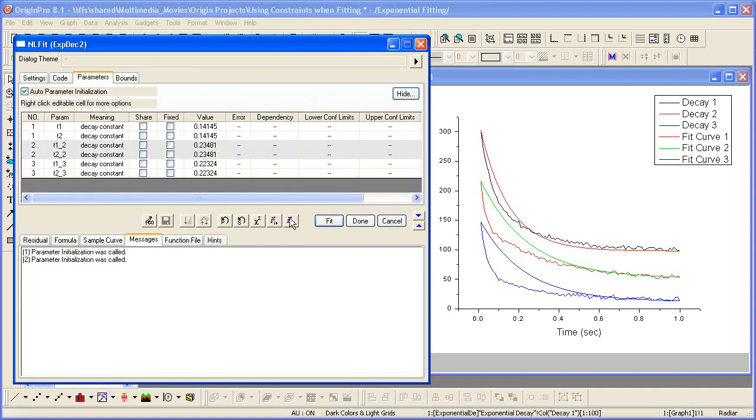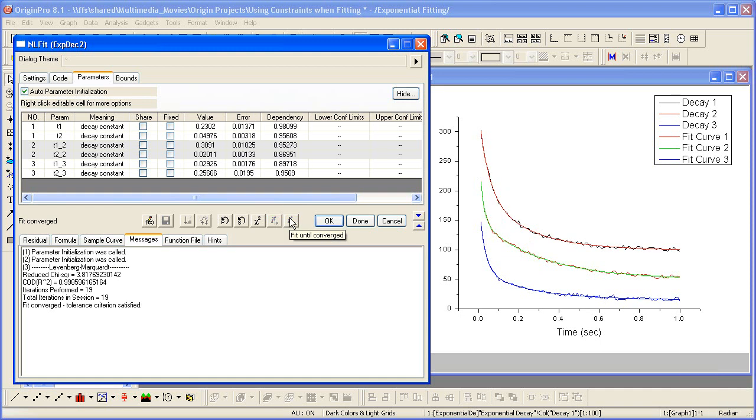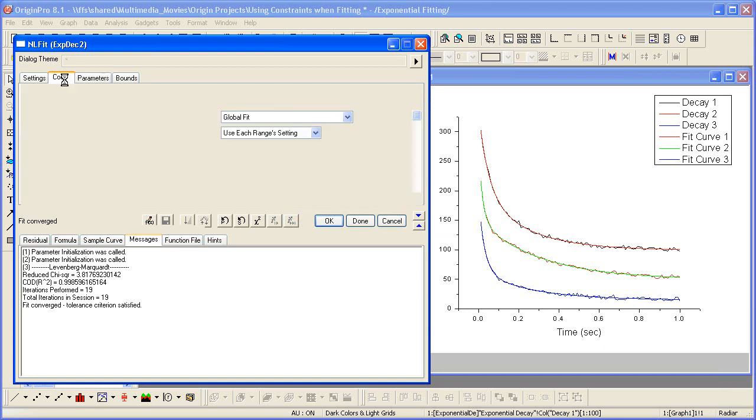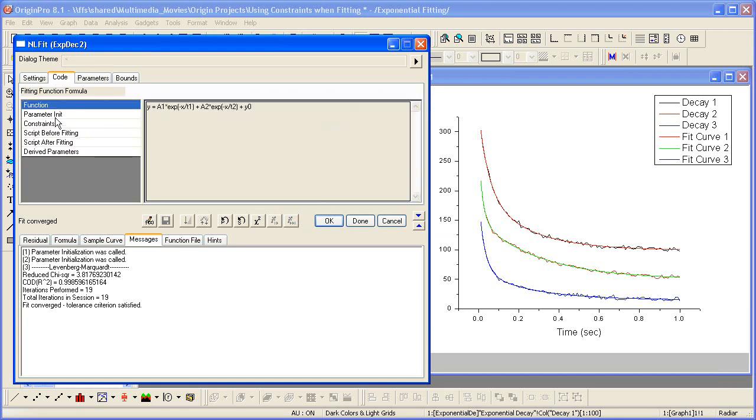Now let's fit until converged. Now let's see how these parameter values will change if we add constraints. To add constraints, you need to go to the Code tab and select Constraints.